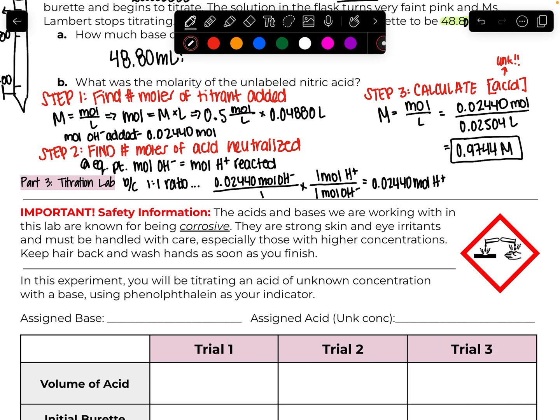I will talk them through with you tomorrow, but acids and bases that we're going to work with are in concentrations that are higher than 0.1 molar, which means we do need to concern ourselves with them. You're going to make sure that you definitely wear gloves if you're working with these things. You're going to wear goggles tomorrow. Acids and bases are corrosive. They're very strong irritants if you get them on your skin, or really bad if you get them in your eyes.